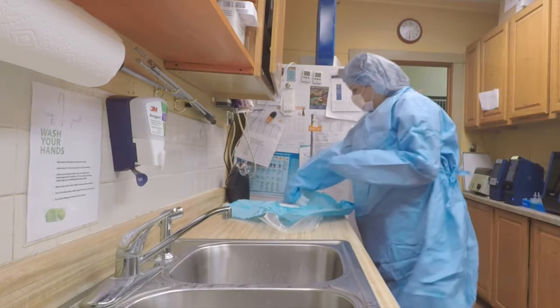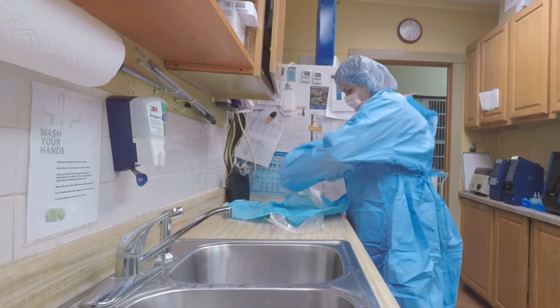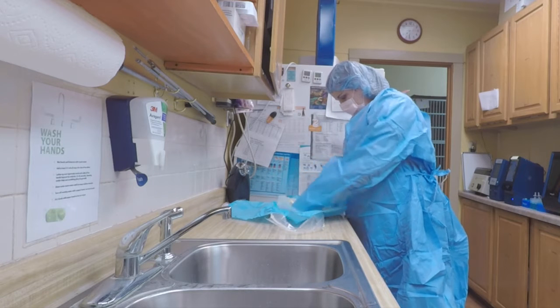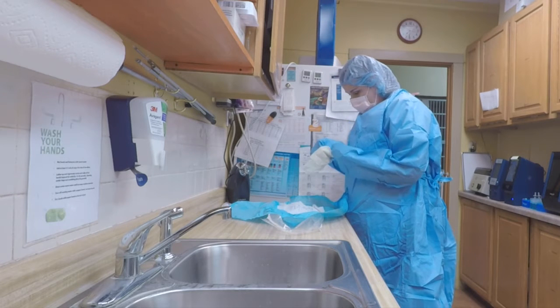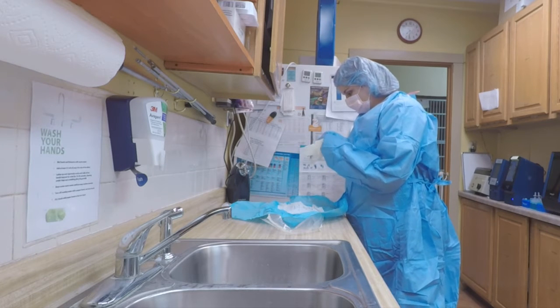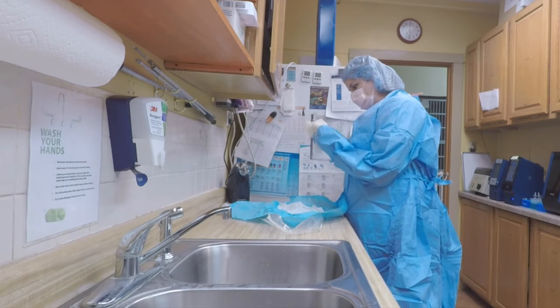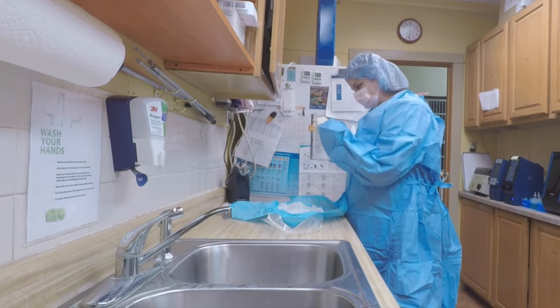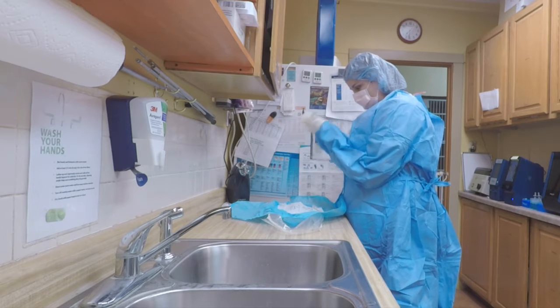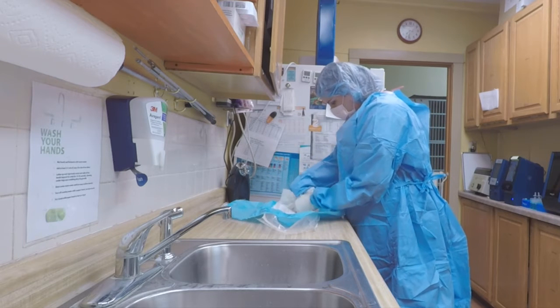Okay, and then you're going to unfold your gloves and put them on. And when putting them on, get the glove over the sleeve just slightly, and do the other one.